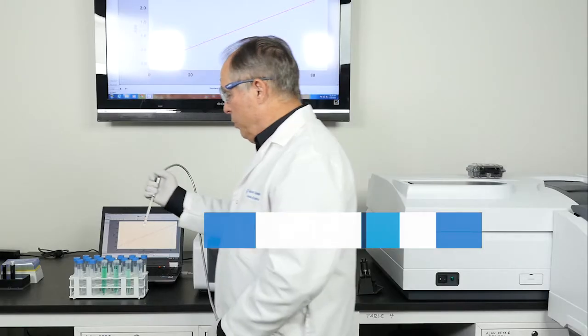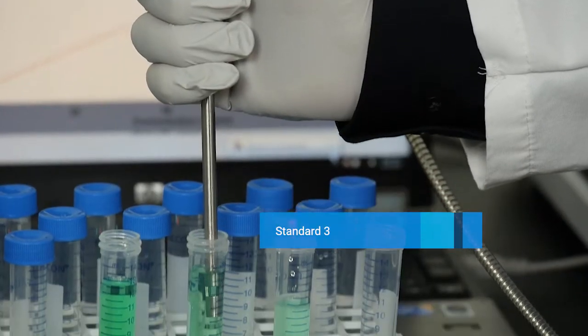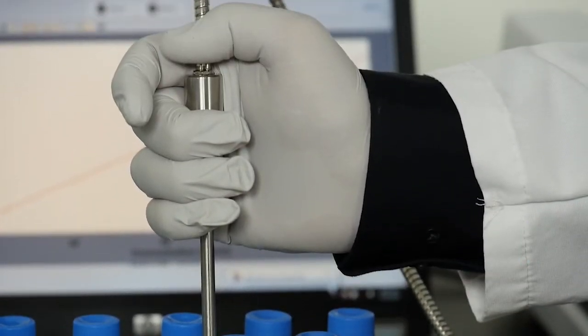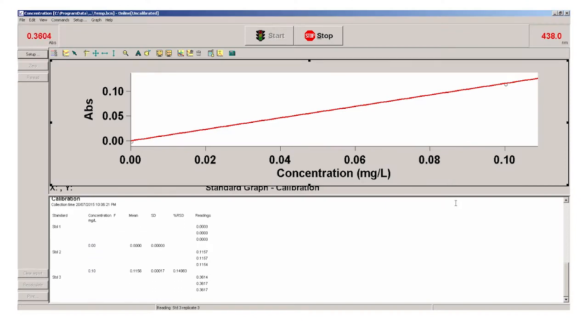So now we'll measure our middle standard. Again, we'll put the probe into the solution, press the trigger, and now the measurement's made.